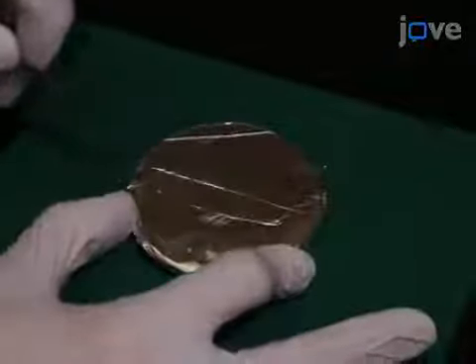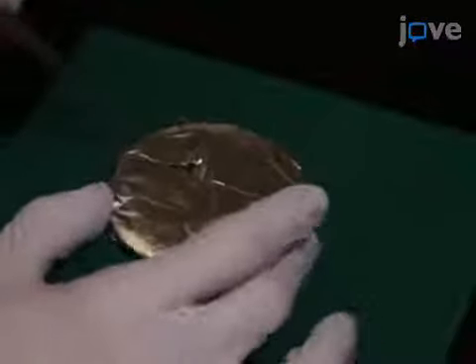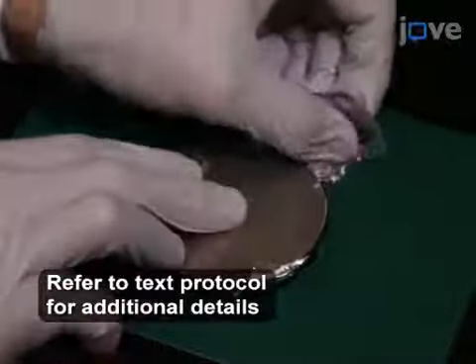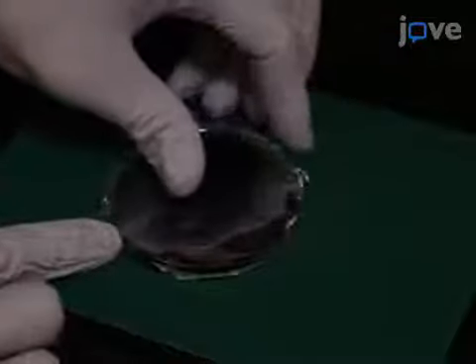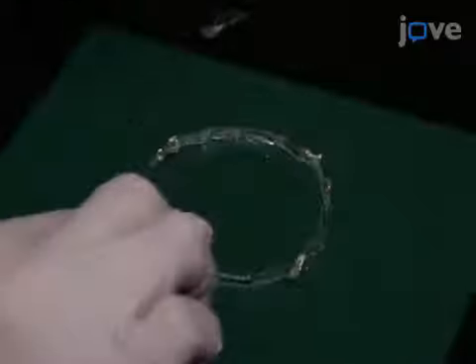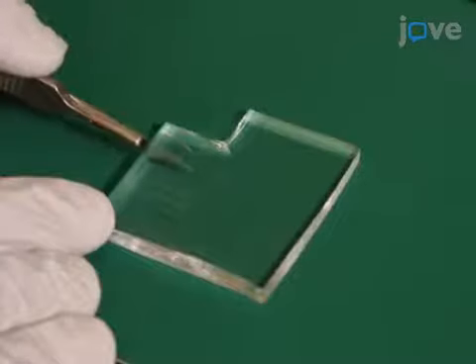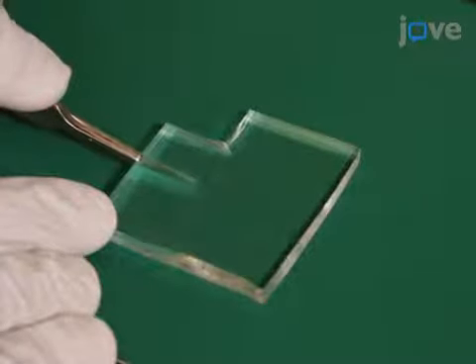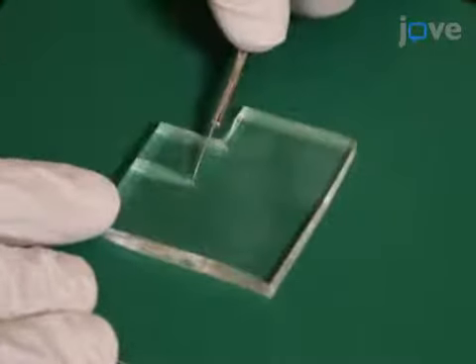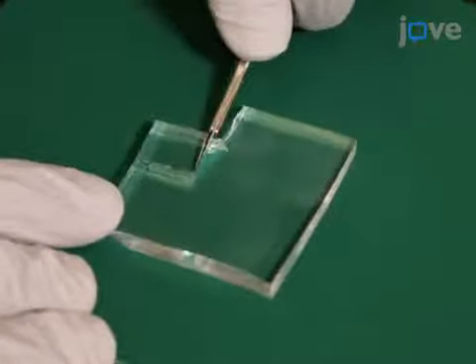Carefully score and peel off the aluminum foil from the back of the master, then carefully peel the PDMS from the master. As a wafer typically includes several microfluidic devices with slightly different dimensions, use a clean sharp scalpel to cut a single device to the appropriate size.